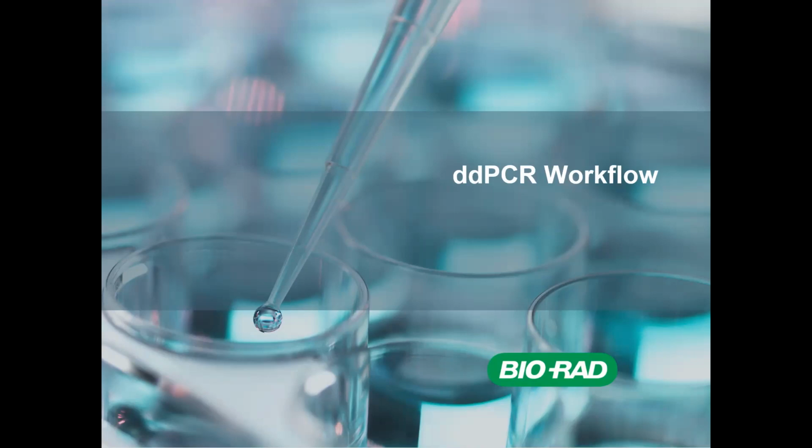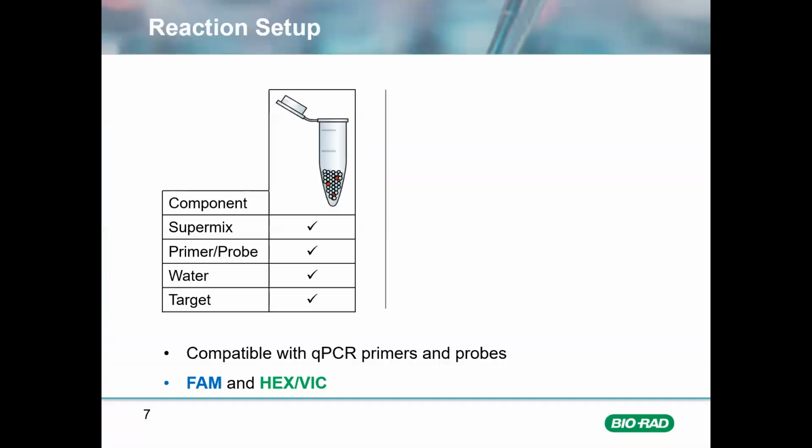Okay, so let's quickly go through what the workflow looks like. For a reaction setup, you're going to set up your samples just like you do with traditional PCR or qPCR. It uses a 2x supermix that has Taq, dNTPs, magnesium chloride, buffers, etc. You're going to add your specific primer and probe, your cDNA, RNA, or genomic DNA template, and then water to bring it up to a 22 microliter reaction.